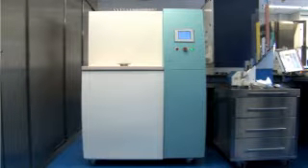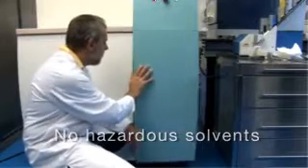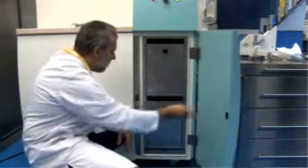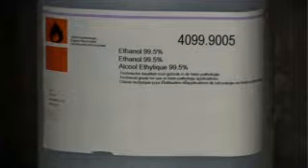The TISPA-1 is the first tissue processor that not only works xylene-free, but is also free of other hazardous solvents like isopropanol or microwave techniques. The only agents used are alcohol, supercritical CO2, and paraffin. That's it. That's all.